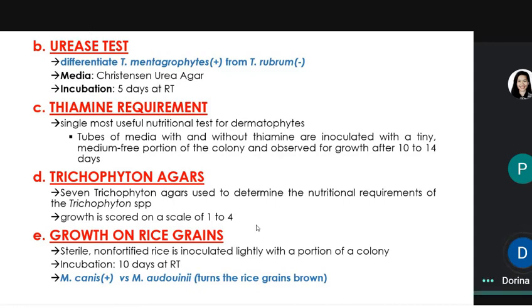It breaks down the urea. Maging ano? Bakit siya magko-color? Anong positive result natin sa urease test? Nandun yan sa exam ninyo. Sa quiz niyo yan kanina, ano? Hindi niyo na matandaan. Ano yung kanyang positive? So, ano yung ginagawa ni urease?